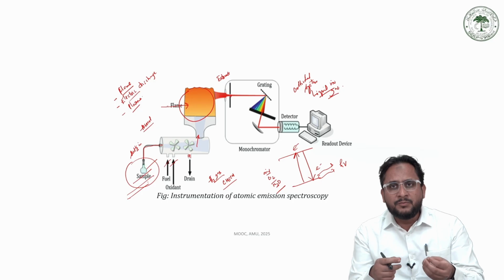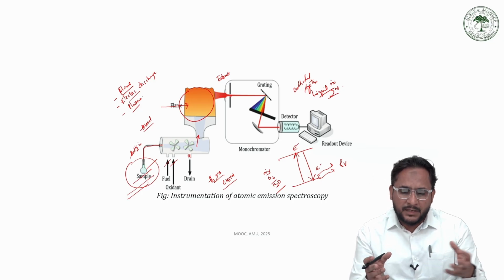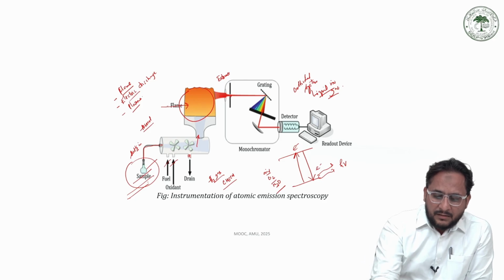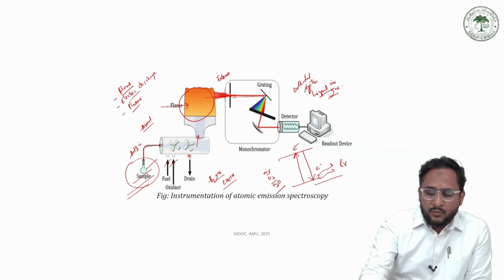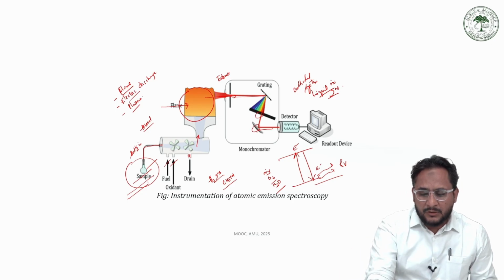And the most important thing is the prism or a grating, which is used to disperse light into individual regions.